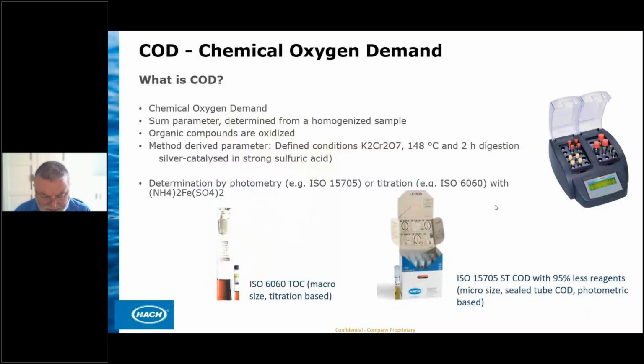Example of COD, chemical oxygen demand. It is a parameter commonly used in wastewater and in water treatment measurements. The historical standard ISO 6060 recommends measurement by titration after mineralization.